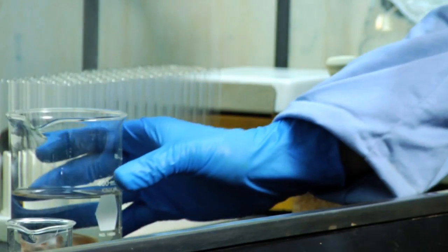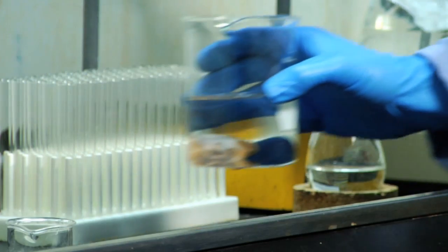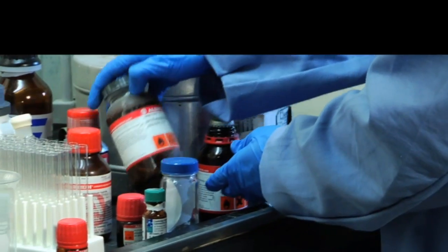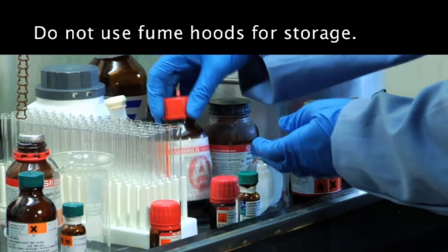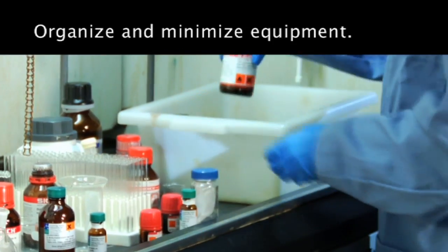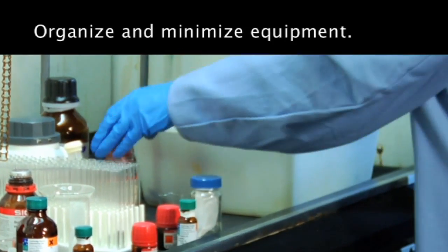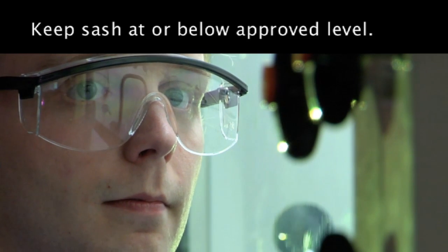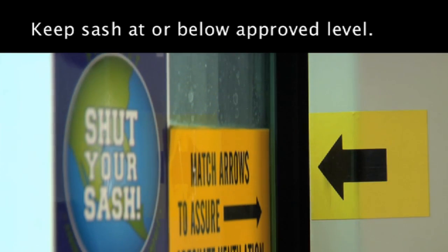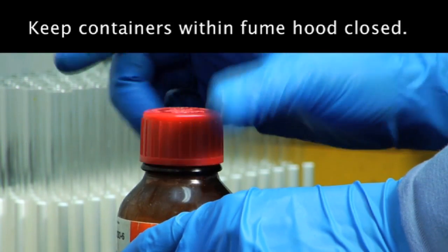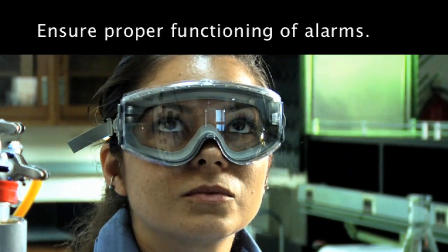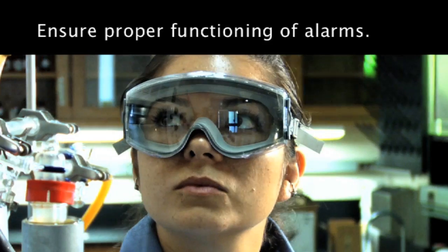To ensure proper functioning, fume hoods must be carefully operated, maintained, and kept free of unnecessary clutter. Do not use fume hoods for storage. Organize and minimize necessary chemicals and equipment. Keep sash at or below approved level. Keep chemical containers within the fume hood closed. Ensure proper functioning of audible and visual alarms.